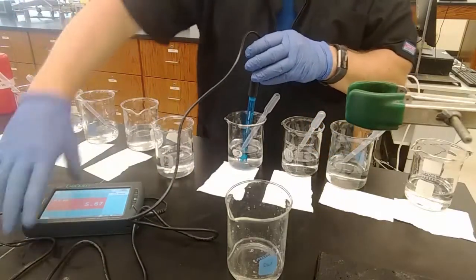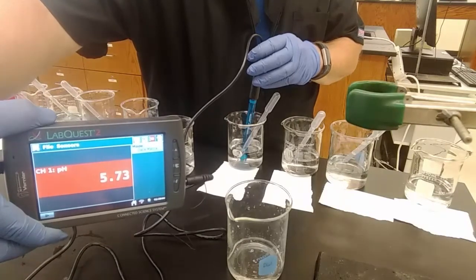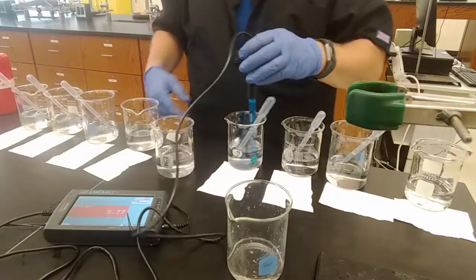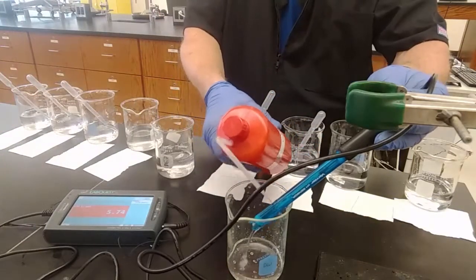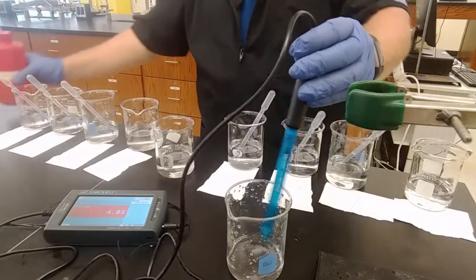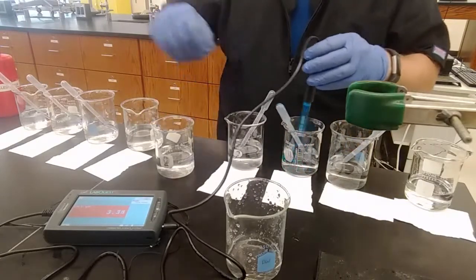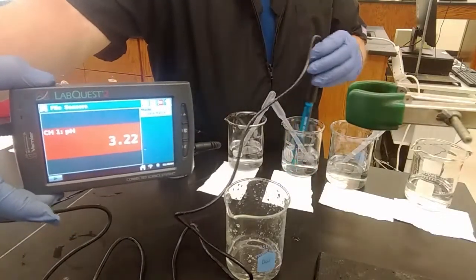All right, so pH 4 ended up being significantly higher. 5.73, and we were expecting a pH 4. Let's see if we at least can get lower when we go into pH 3. We know there's more acid in it, because you watched me dilute it. So far, so good. It at least is lower.